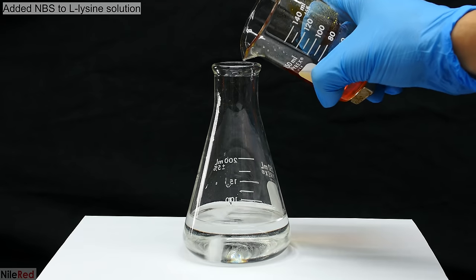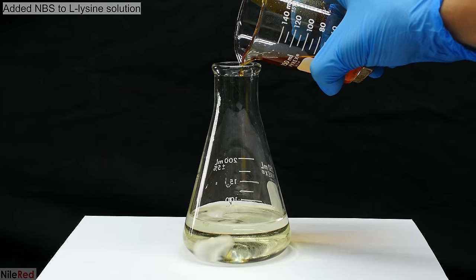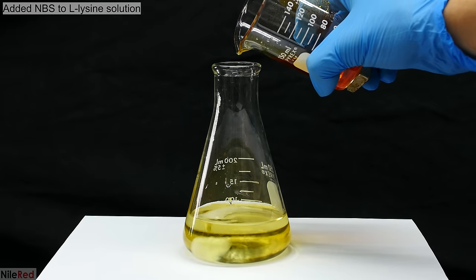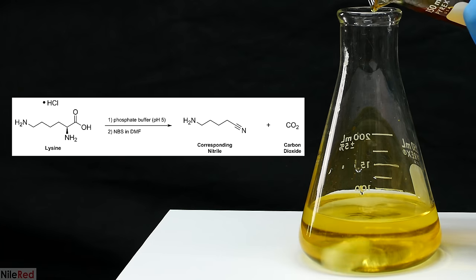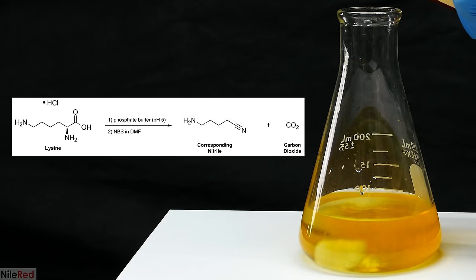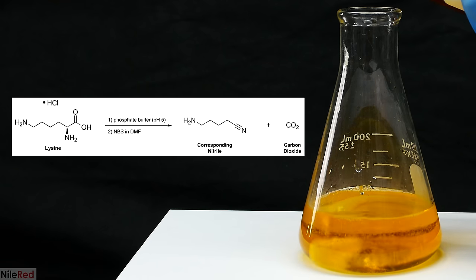The NBS solution is then added slowly to our buffer solution. You can see that CO2 is being evolved very shortly after the solution is added. What's going on here is an NBS induced oxidative decarboxylation of an amino acid. This is the overall reaction that we're doing here, where we're converting the amino acid to the corresponding nitrile.